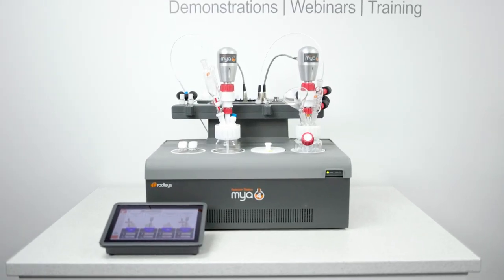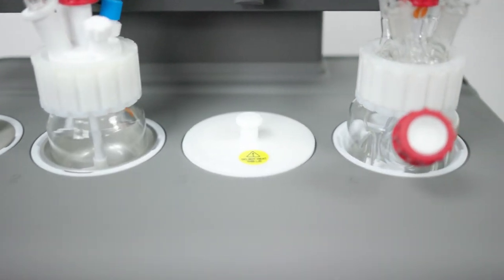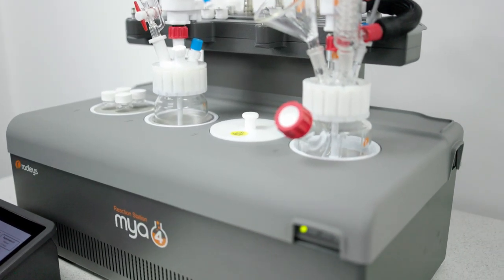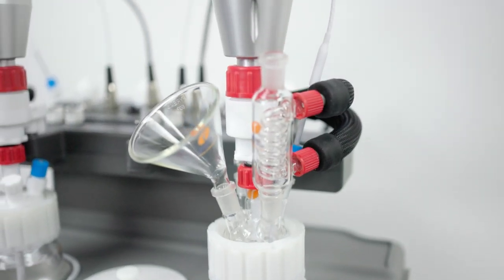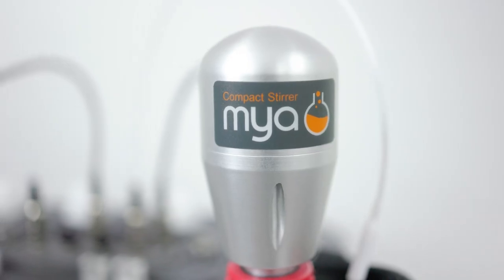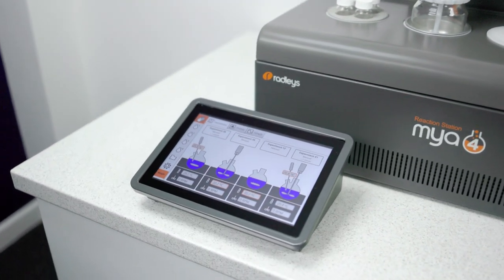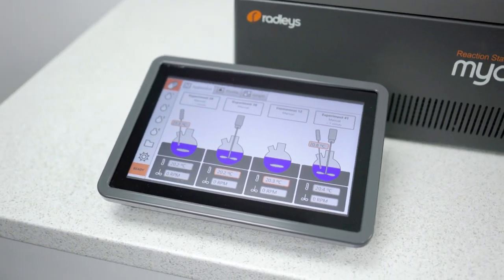The Mya 4 has four independent reaction zones, each with their own active cooling and precise heating, offering a temperature range between minus 30 and plus 180 degrees. With reaction vials and vessels from 2 mils to 400 mils and optional overhead stirring, it's perfect for a wide range of chemical reactions. Everything is controlled and all data is logged through the control panel. It's incredibly easy to use and provides information rich results.